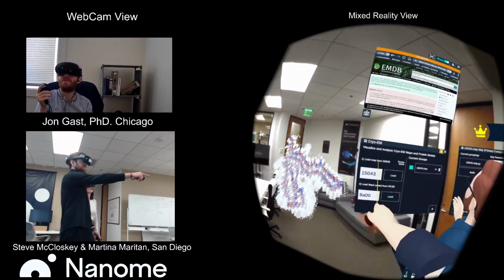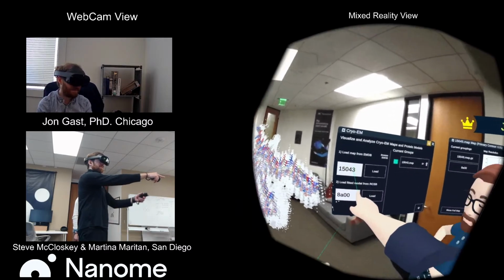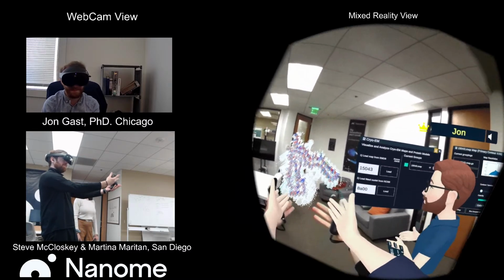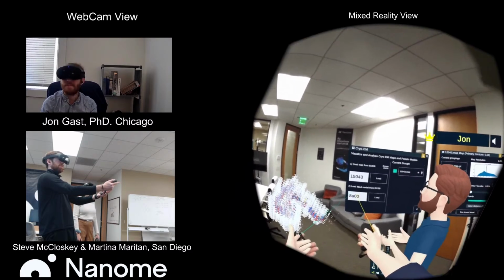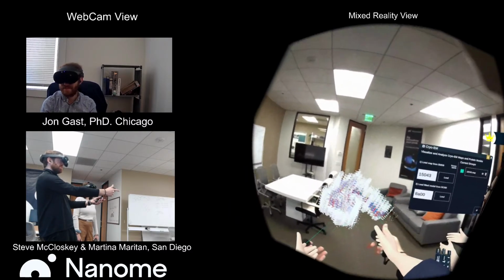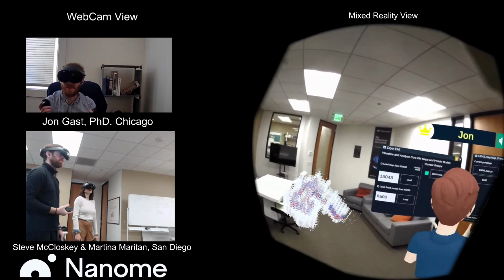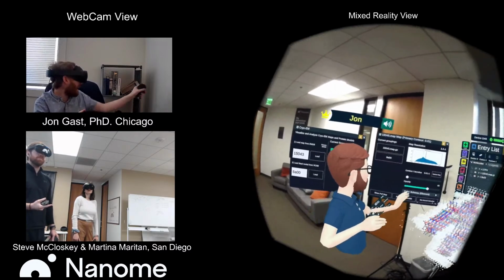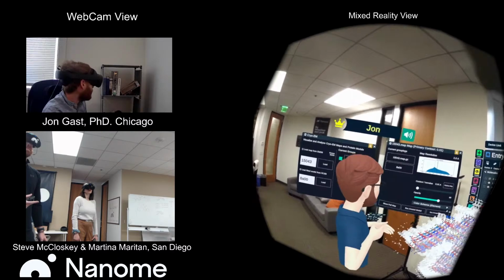Great. So really in Nanome you just need the EMDB code right here. Once you input that, you're pretty much good to go, and through the plugin it'll import the map, find an associated RCSB Protein Data Bank file, and get the solved computational structure. Absolutely. And so from here, we brought it all in, nice and easy. We now have our cryo-EM menu that we can look at right here.